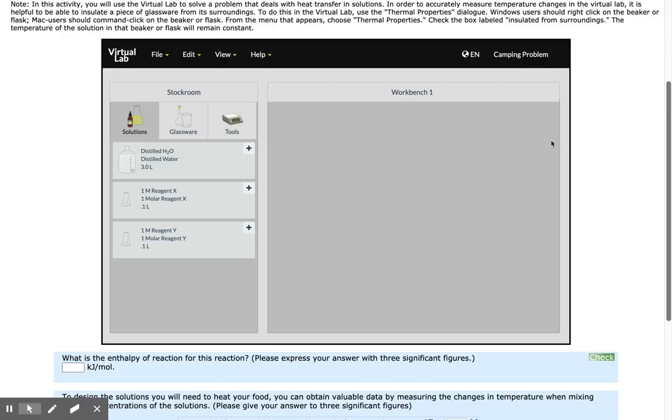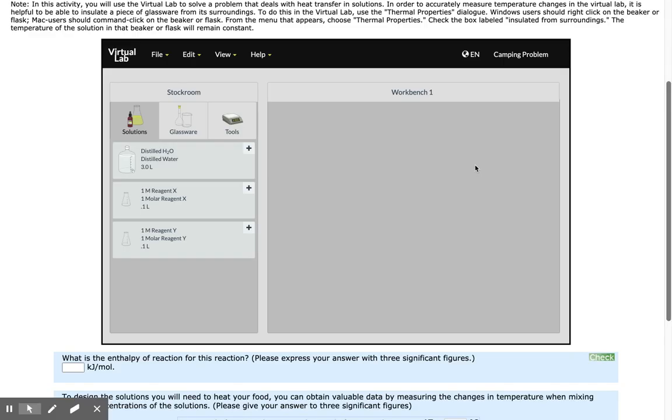First, you'll need to perform calculations of how much stock reagent you need to mix each volume of solution at a specific molar concentration. For this demonstration, I'm mixing 250 milliliters of 0.1 molar concentration for both of my reagents.